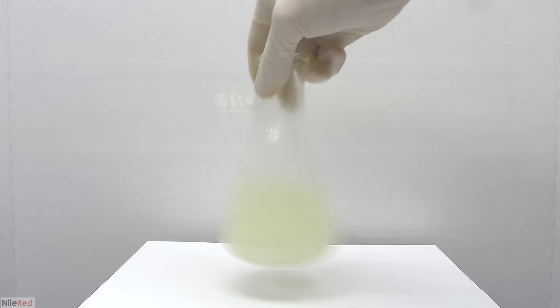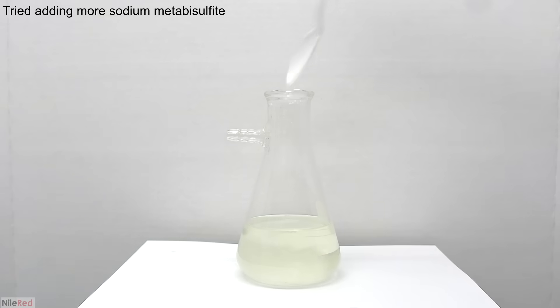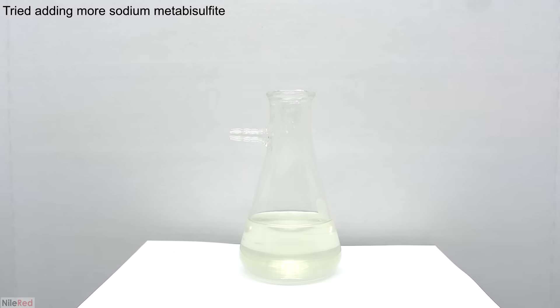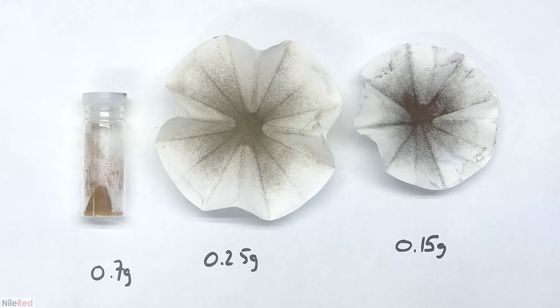With everything filtered through we can move on to our precipitation step, so we dump in some sodium metabisulfite. Just like before I swirled things around and the solution became colorless, but this time no gold really precipitated out. I think my solution was way too dilute, so when I precipitated things it made particles that were too finely dispersed and they couldn't really aggregate. All of the gold from the dram vial was then isolated using a little bit of filter paper. In the end this is the gold we got from our various sources: on the left from the RAM trimmings, in the middle from the miscellaneous PCBs, and on the right from our friend Robert.